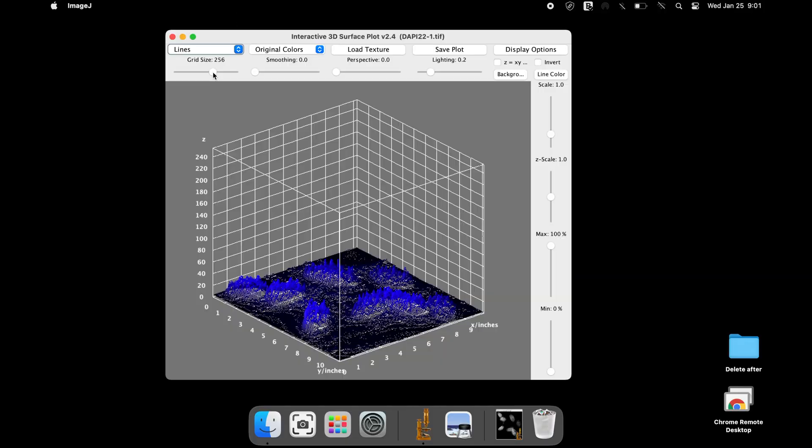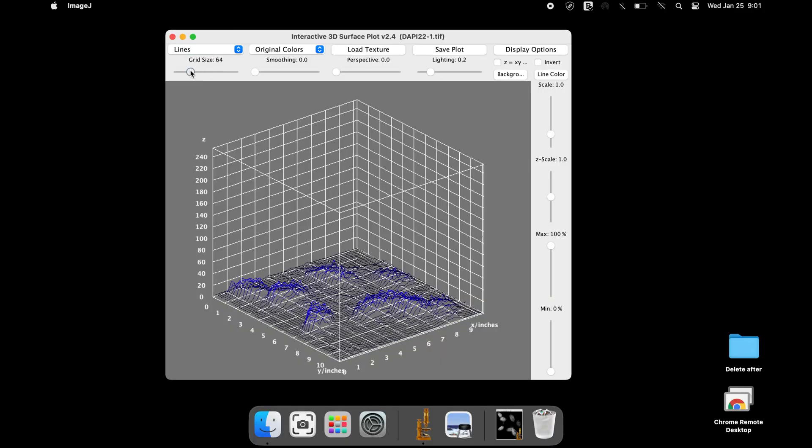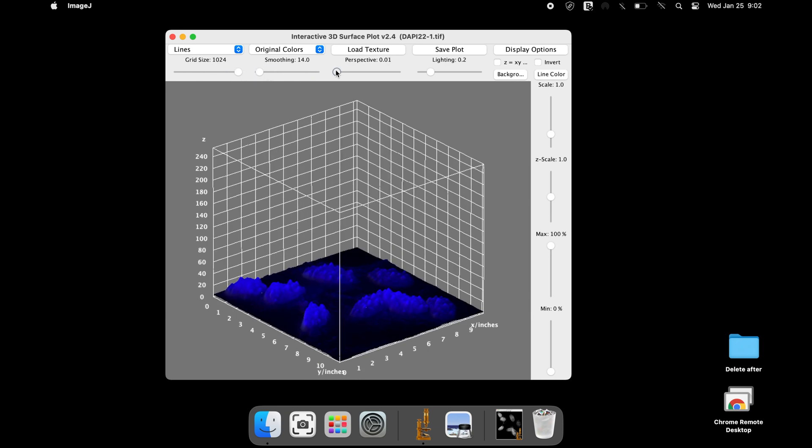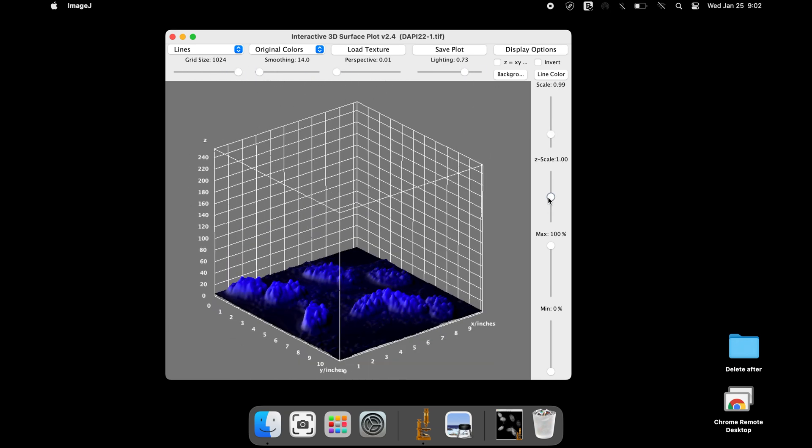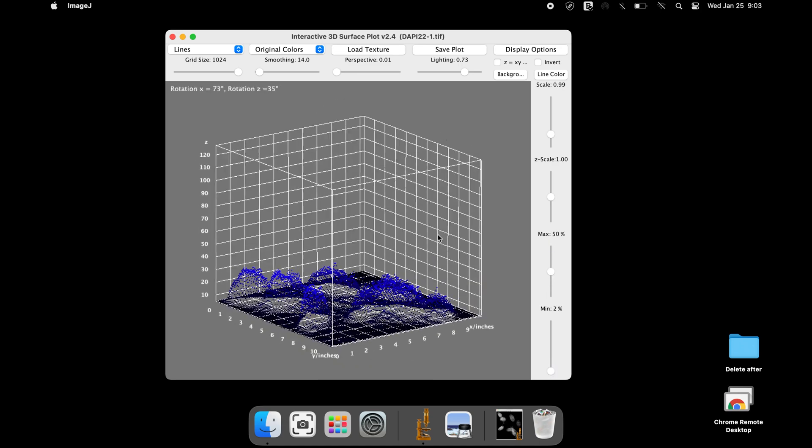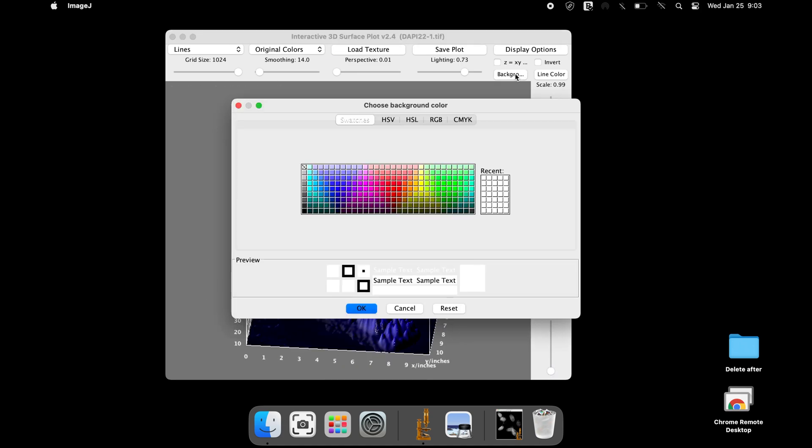There are several options that can be used to modify the size, texture, color, orientation, and axis of the surface plot. There is also an option to change the background and the line colors.